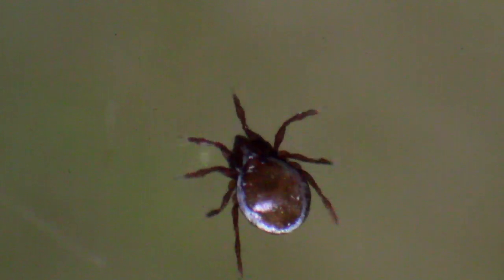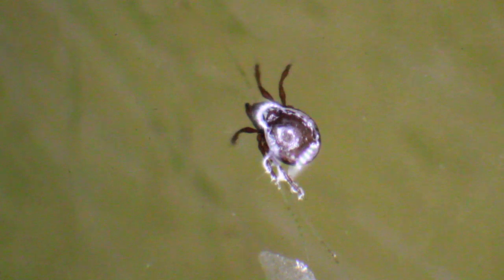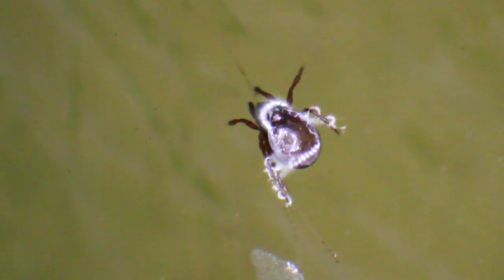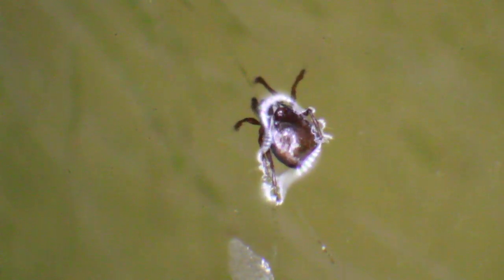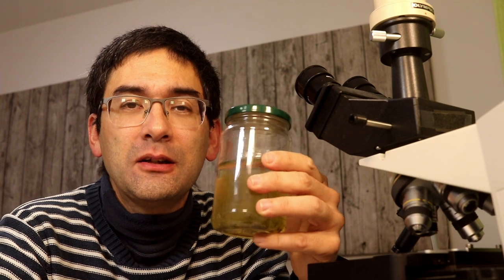You can see the ring lamp of my microscope there as well, and it was struggling to swim away but it couldn't because it got stuck right on the surface of the water. It's quite fascinating to see, and you can see on one mite eight legs — very typical. I want to have a slightly closer look at the mites, so I'm going to put them under my compound microscope.